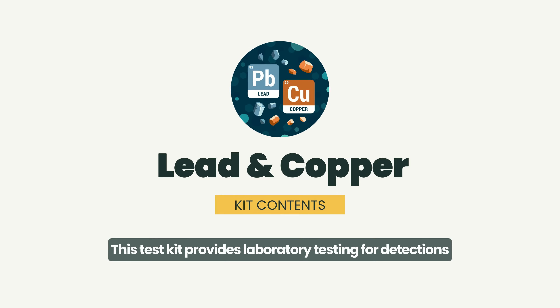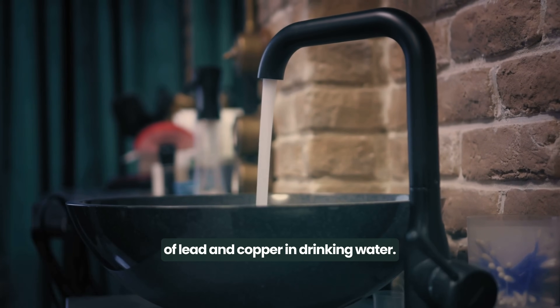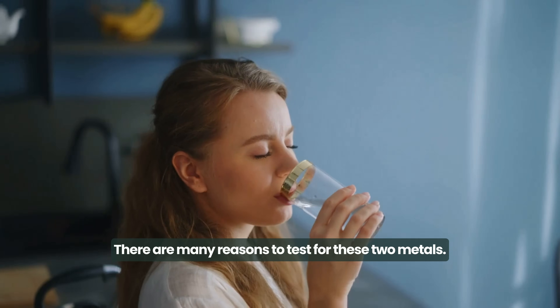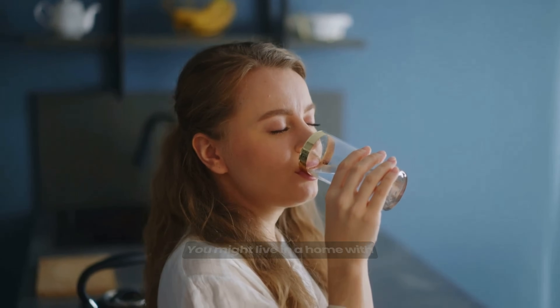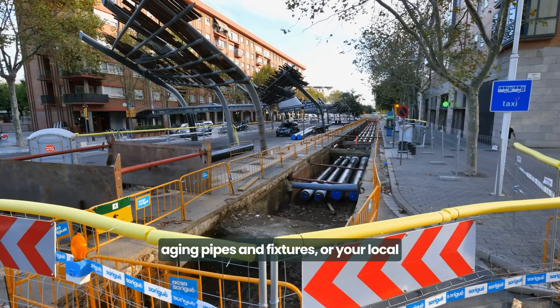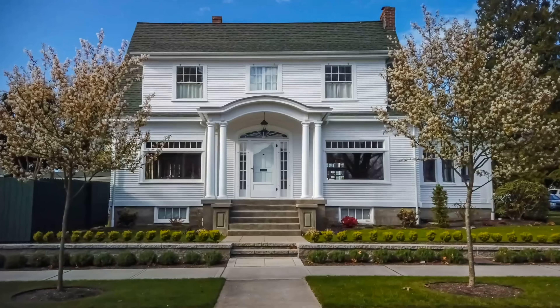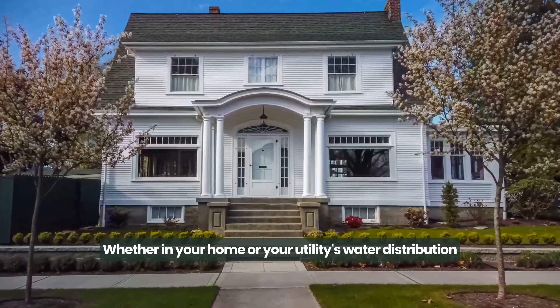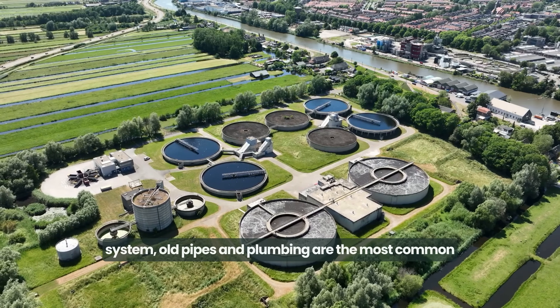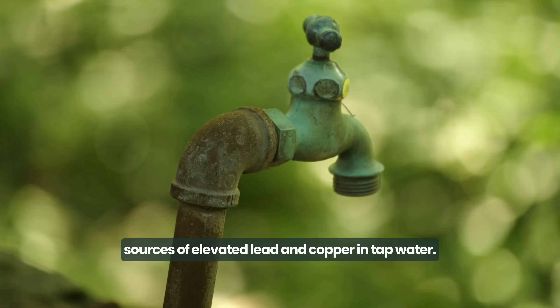This test kit provides laboratory testing for detection of lead and copper in drinking water. There are many reasons to test for these two metals. You might live in a home with aging pipes and fixtures, or your local water infrastructure might contain lead components. Whether in your home or your utility's water distribution system, old pipes and plumbing are the most common sources of elevated lead and copper in tap water.